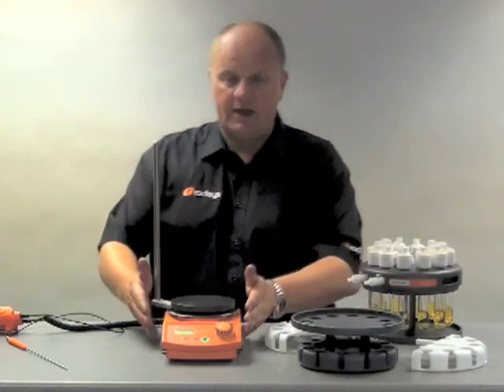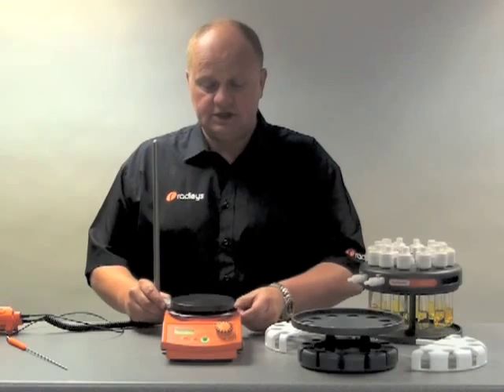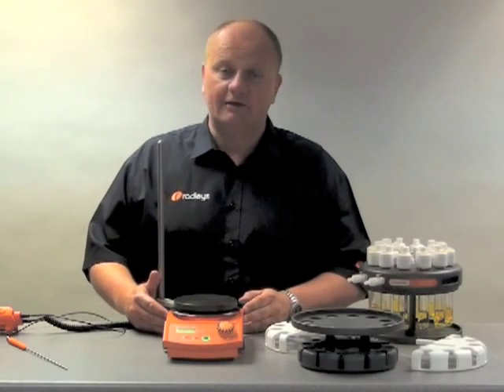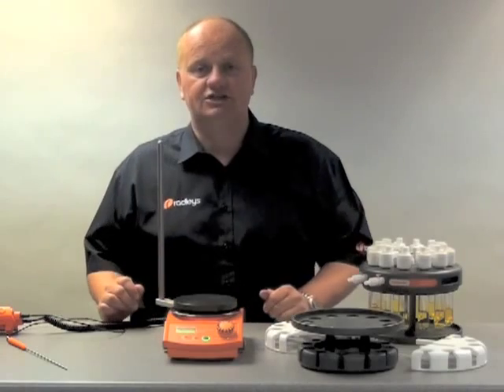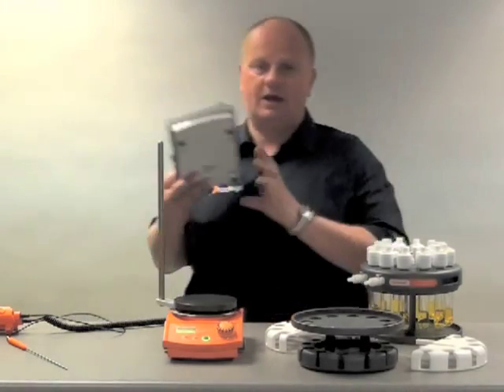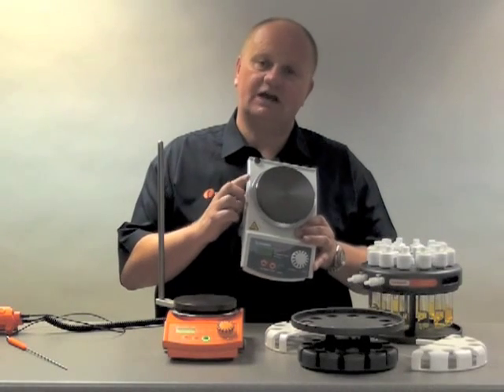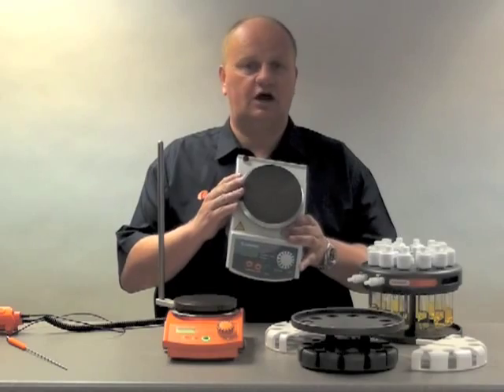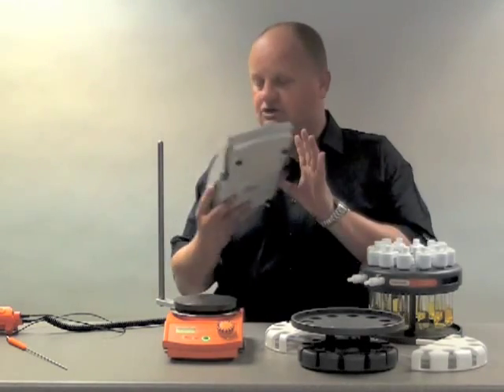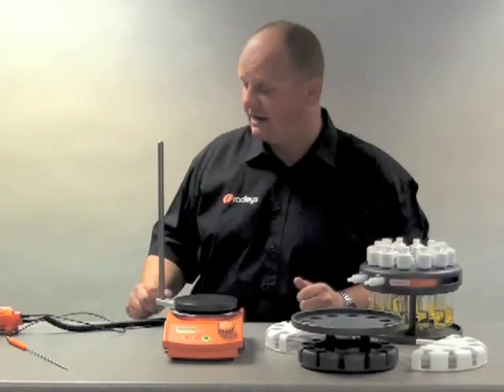Let's start at the beginning. Here we have a standard stirring hot plate. These are manufactured for Radleys by Heidolph. The difference between these and Heidolph, other than the lovely orange colour, is the top plate which is 135 mm. The standard Heidolph hot plates have a top plate that's 145 mm. The Carousel unfortunately will not fit on 145 mm, which is why Heidolph manufacture these specially for us. There's a range of three hot plates; this particular one is the Tec.